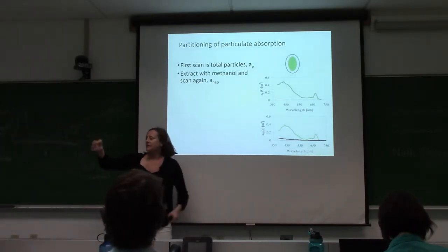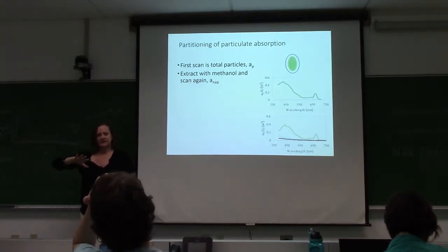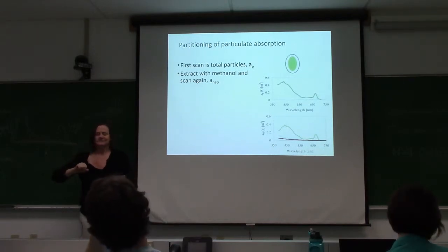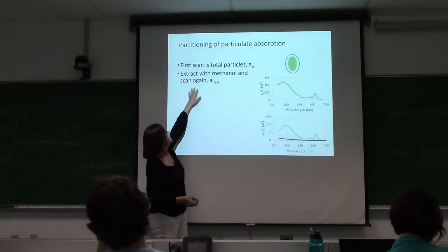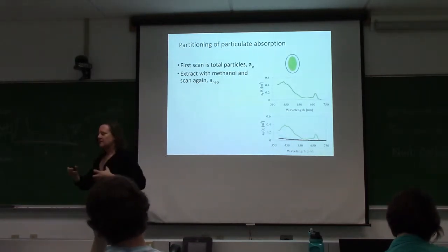Then you put it back in the filter cup. You put methanol on top, because methanol is very gentle, not gentle enough to drink, but gentle to extract. And then you scan it again. So you filter that through. It removes all of the pigments.